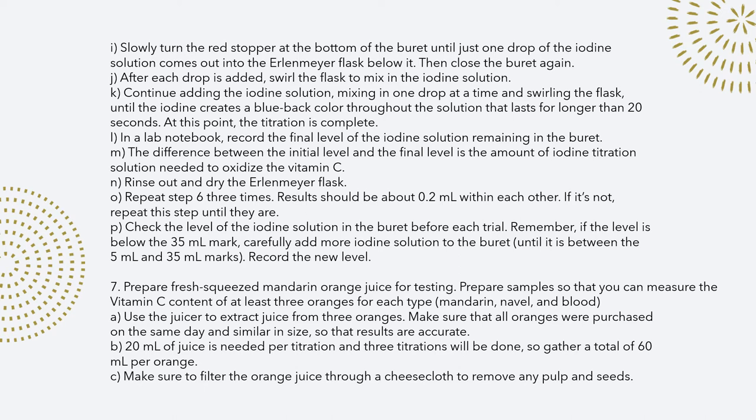When the color changed, I made sure that I recorded when it first changed and not after it had already changed for a while. Once you do the first trial, I repeated it two more times so that I could have three trials, making sure that they were all within 0.2 of one another. After each trial, I refilled the iodine in the burette.